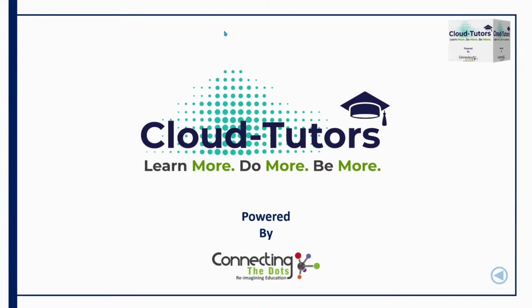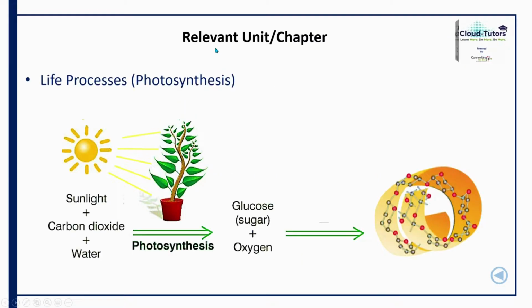The experiment that we are going to demonstrate is the starch test for the given food samples. The starch test is relevant for the grade 10 life process chapter, where we have a topic called photosynthesis. We all know the equation for photosynthesis: we need carbon dioxide and water. In the presence of sunlight and chlorophyll, the plant will synthesize glucose and oxygen.